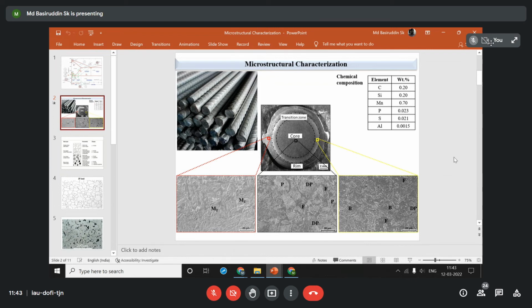So here the purpose of showing this is how the phases contribute to changing the hardness of a material. When we find macro hardness which is the same everywhere, we can think that the sample microstructure is the same throughout the cross section of that specimen. Therefore we are getting equal hardness in each and every place.